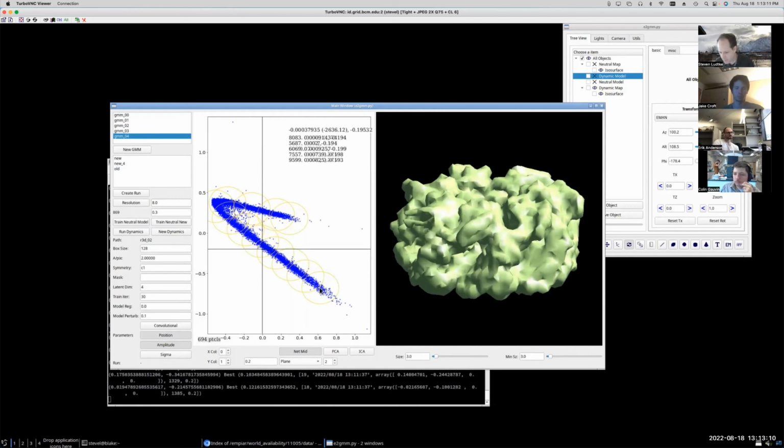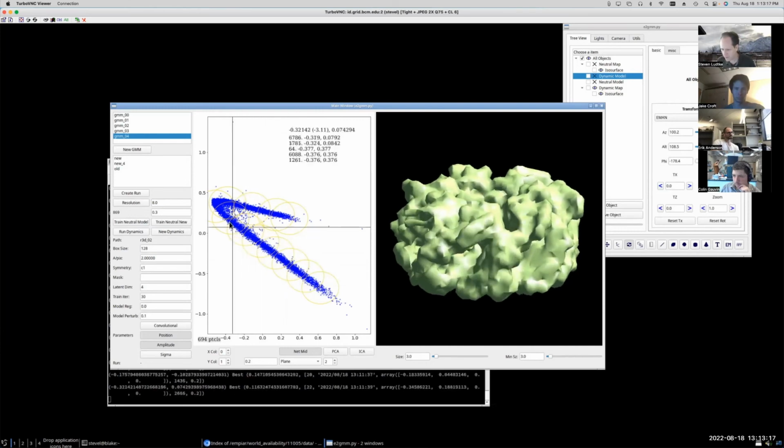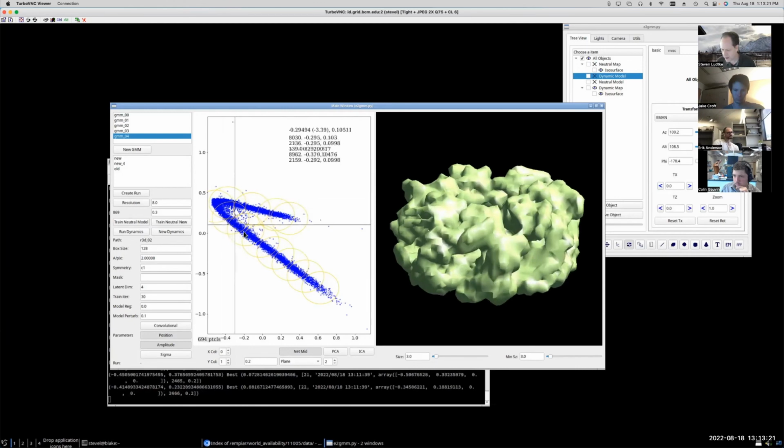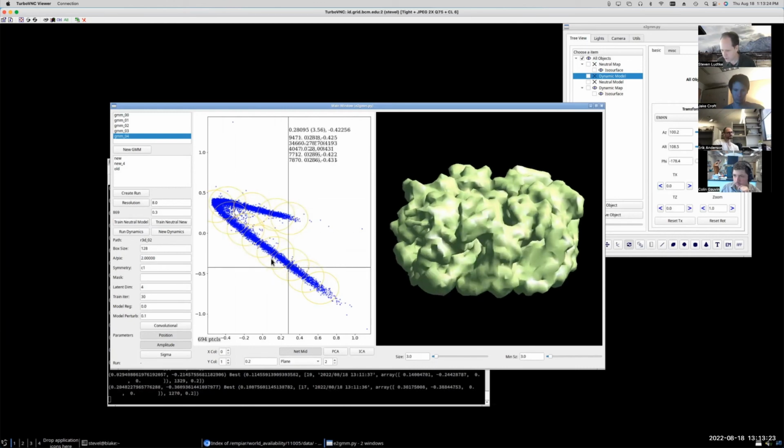So if I made them overlap even more, I could make this a lot smoother. I could make the transitions from one state to the next look a lot smoother for a continuous motion. So each of these structures that I've got here is still going to have a certain amount of motion blurring based on the size of the circle that it's drawing on the screen.